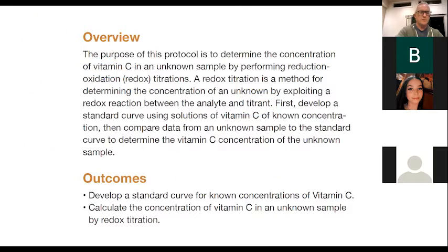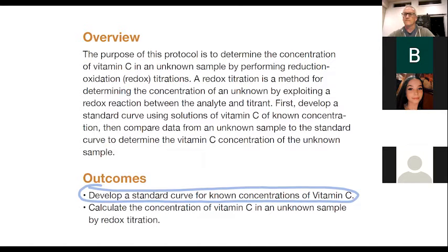So what we're going to do is when you do a titration, we develop a standard curve. Want to tell me what a standard curve is? What does a standard curve mean? What do we do when we develop one of those?